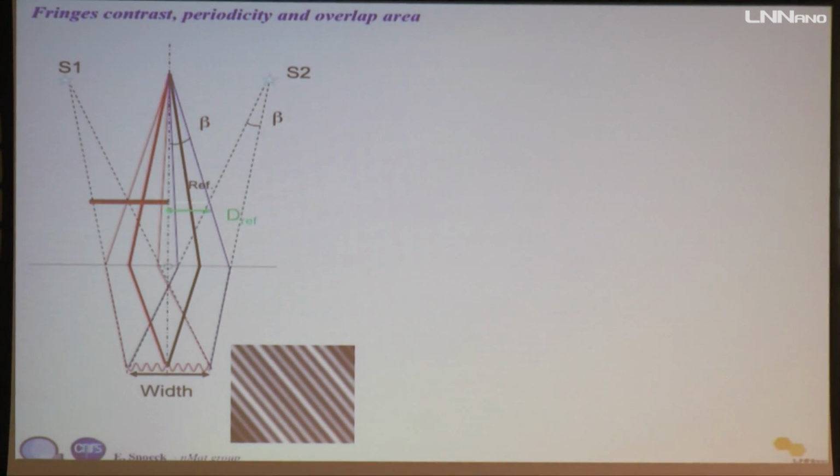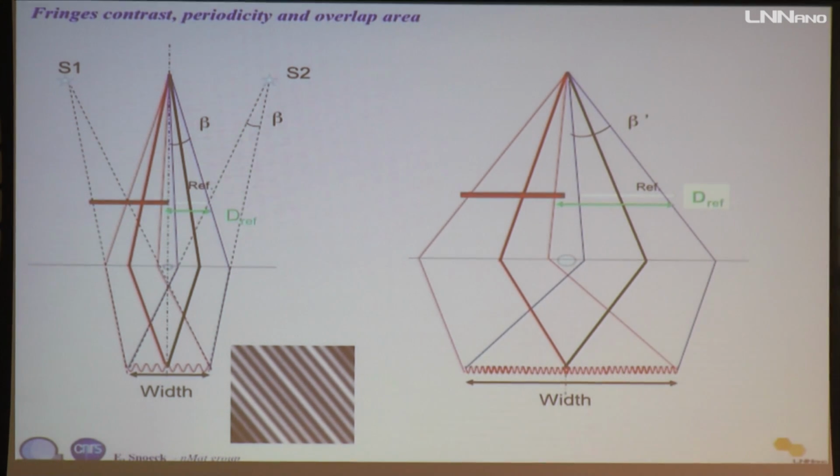It corresponds, if you can imagine, to these two beams coming from two virtual sources, which you can draw geometrically, and this will be this one. If you increase the voltage here, it will bend even more, just like if you put the sources even further apart, and then you increase the width of the hologram a lot.